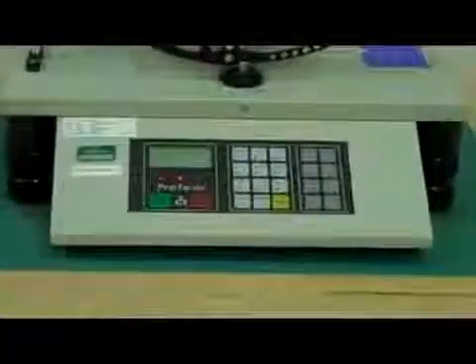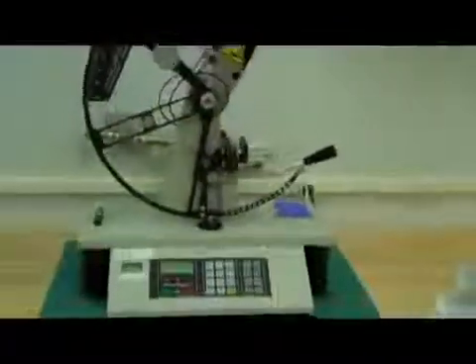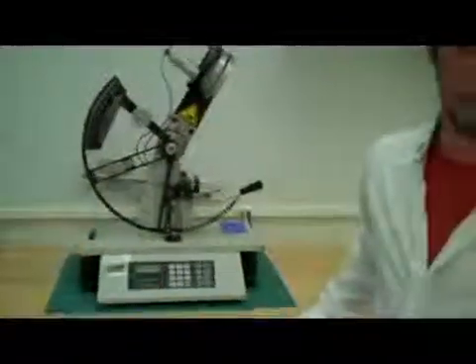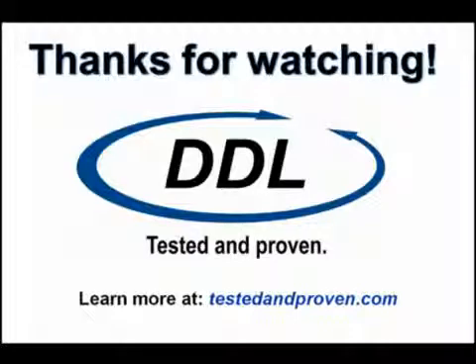The force is output by the machine, and you can use that data to compare your various age intervals as well as your pre and post sterilization values.